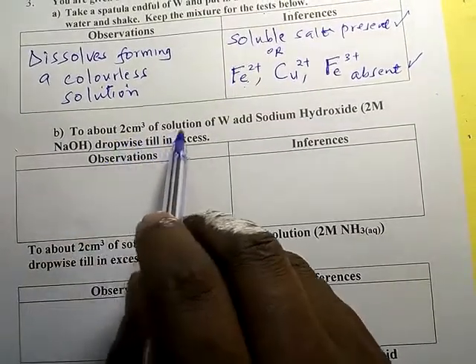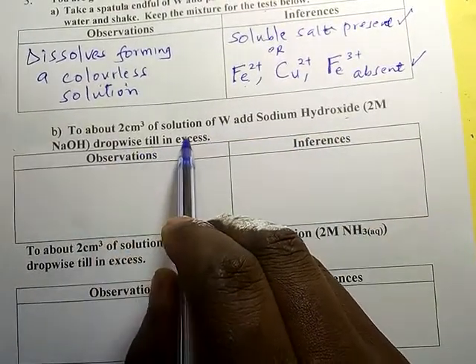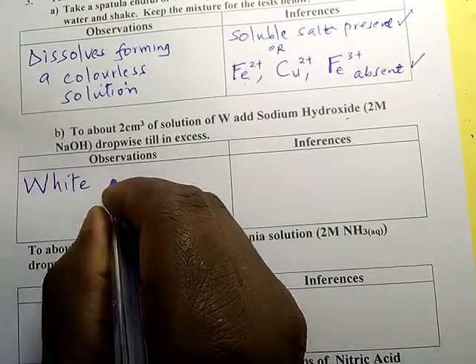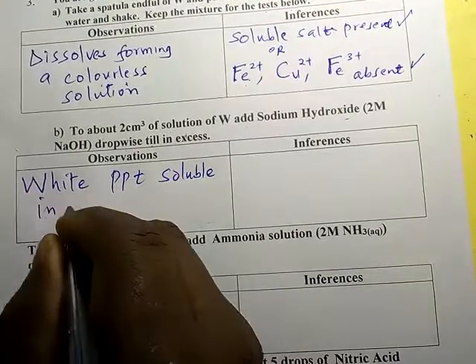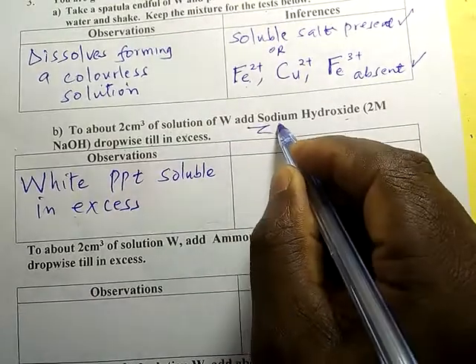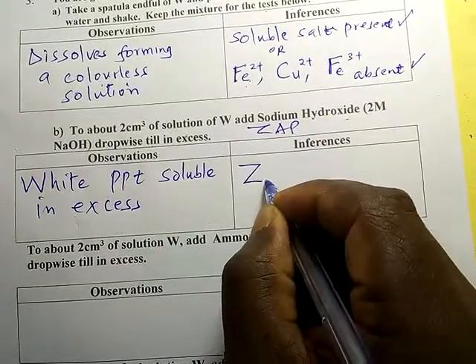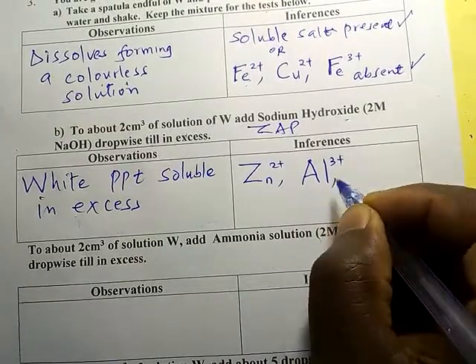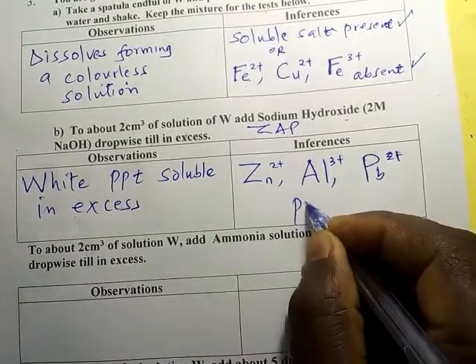To about 2 centimeters cube of solution W, add sodium hydroxide, dropwise till in excess. White PPT soluble in excess. So that shows you that the amphoteric ions, they are the ZAP, zinc ions, aluminium ions, and the lead ions. So you start with zinc, 2 positive, aluminium, 3 positive, and lead, 2 positive. They are present.